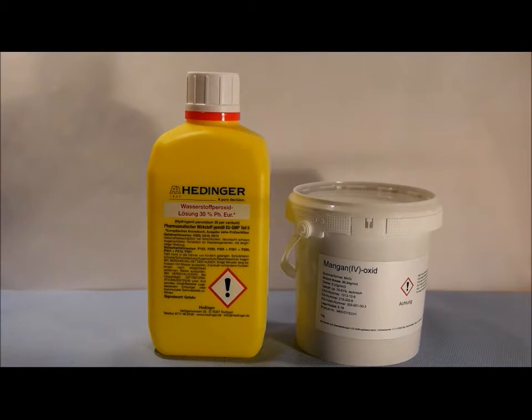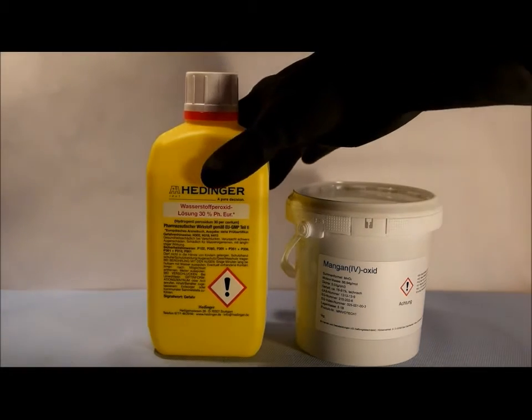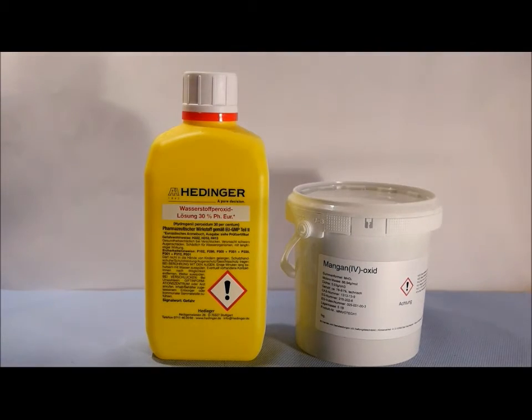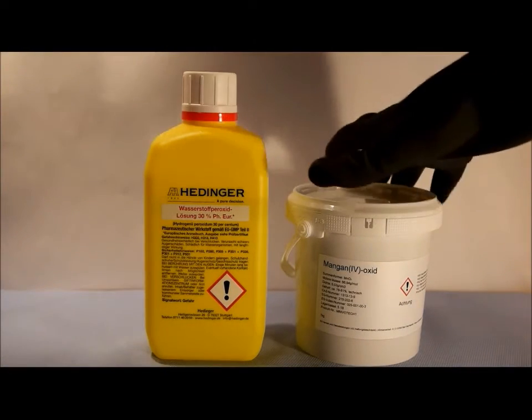Today I'll show you how to produce oxygen by reaction of hydrogen peroxide and manganese dioxide. This hydrogen peroxide has around 30%, but a lower concentration like 3% will work too.